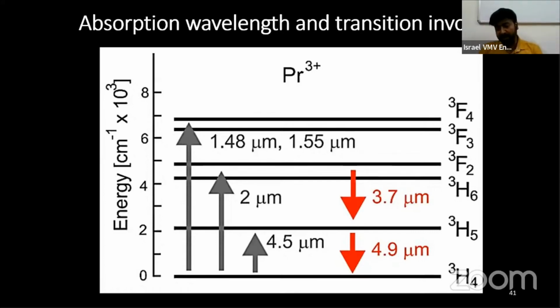In biology also, they have been used for labeling molecules. But the modern application in nanotechnology requires preparing them as nanoparticles. We prepare praseodymium oxide, neodymium oxide, or neodymium ferrite nanoparticles, and we analyze them.